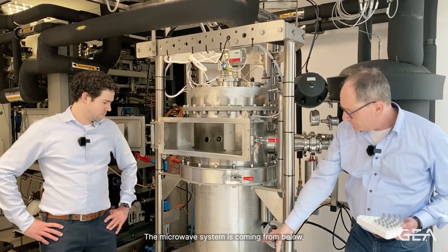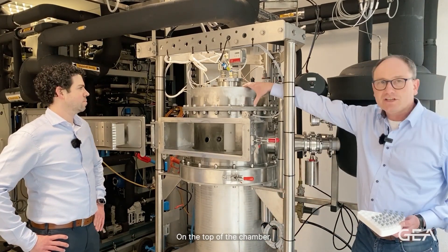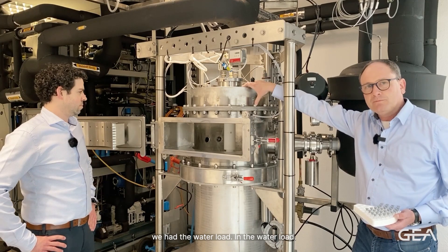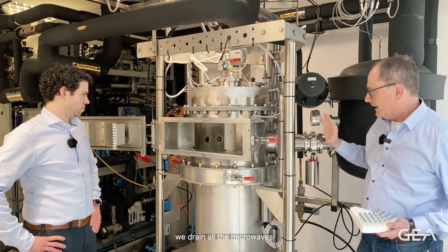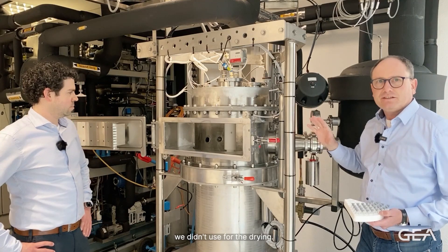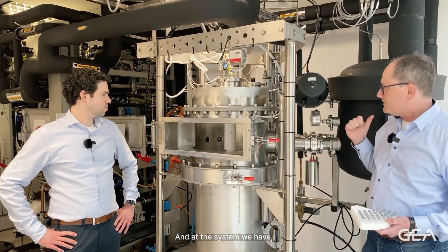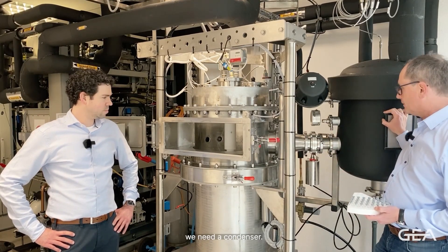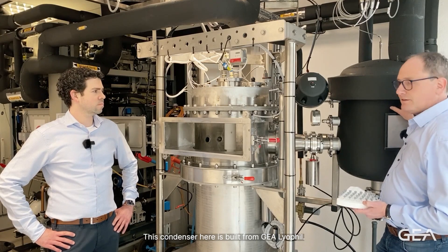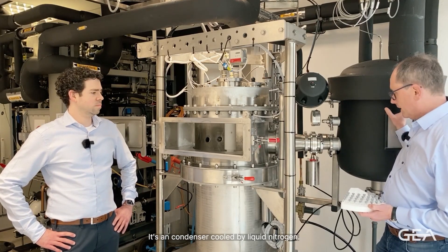The microwave system is coming from below, so the microwaves are coming from below. On the top of the chamber we have the water load. In the water load we drain all the microwaves we didn't use for the drying. At the system we also have a condenser — for every freeze dryer you need a condenser. This condenser here is built from Lyofil; it's a condenser cooled by liquid nitrogen.